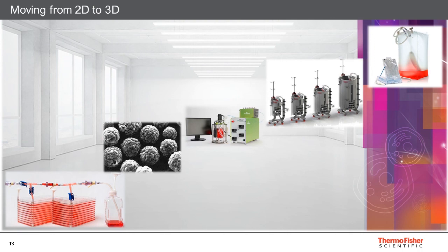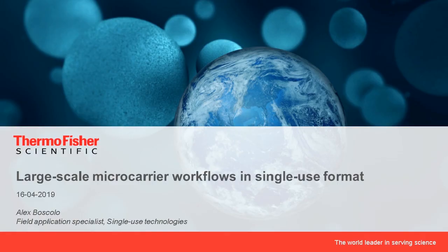And so further down in this presentation, we're going to discuss how those adherent cell cultures can be scaled up from the cell factory systems, as an example, into microcarrier applications, put into benchtop systems, into single-use bioreactor systems, and how some unique harvesting technologies can be utilized to make that a successful workflow.